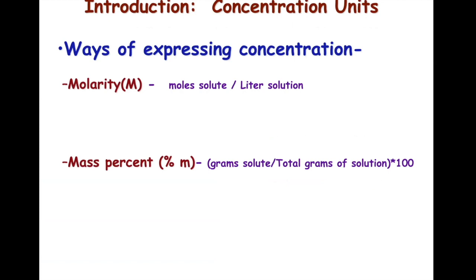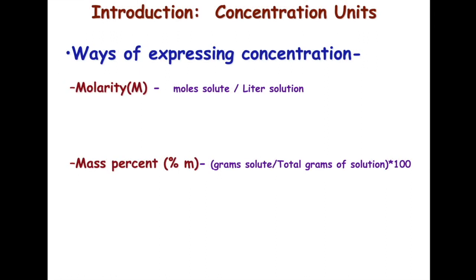What you guys are going to be doing is calculating the concentration, more specifically the mass percent. Your next experiment, the titration of vinegar, you're not only going to calculate a mass percent, but also a molarity. So this particular lab will help give you practice for that calculation. Ultimately you're calculating the concentration of your salt solution. And when you do all 3 trials, they all should be similar to each other.